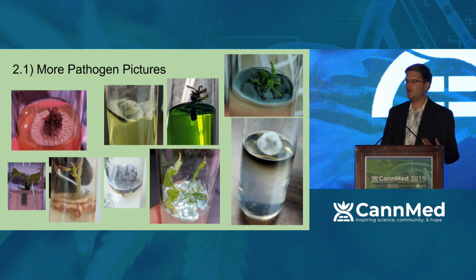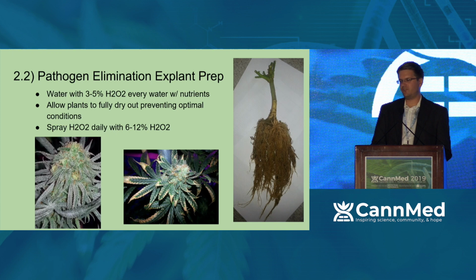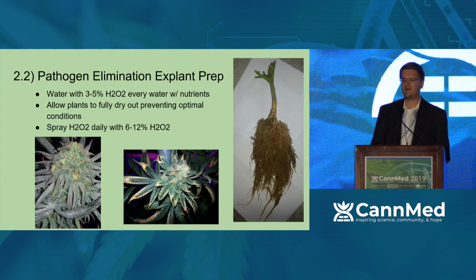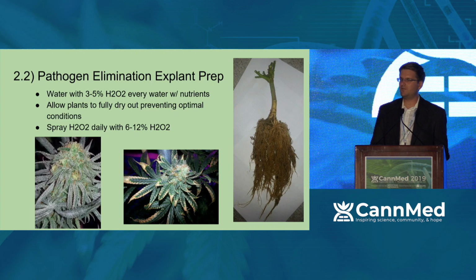So what I did was I noticed we were using inoculants that had endophytic properties, such as the bacillus. What I ended up doing, to get rid of them, was watering with hydrogen peroxide at about a 3 to 5% concentration every day while adding my nutrients to my water. Over the course of about 3 weeks, I actually was able to recover some of these plants to the point where the pathogens, or the endophytes, slowed down inside the plant tissue itself, and you were able to get a couple clean in vitro cultures. And that was huge. Maybe not all of them, but some of them would take.